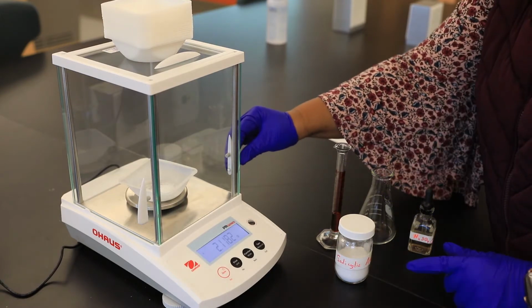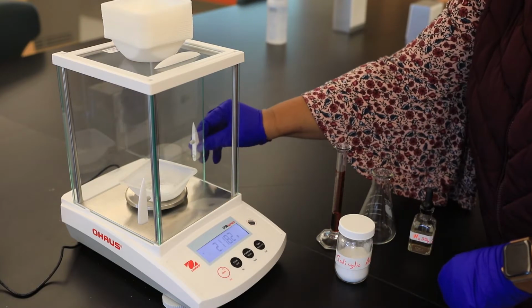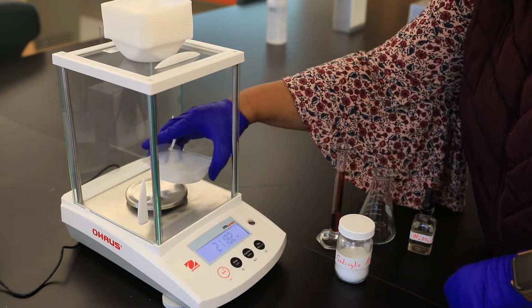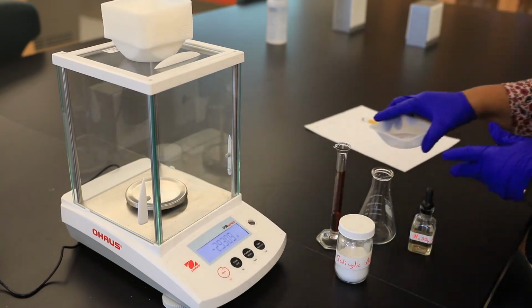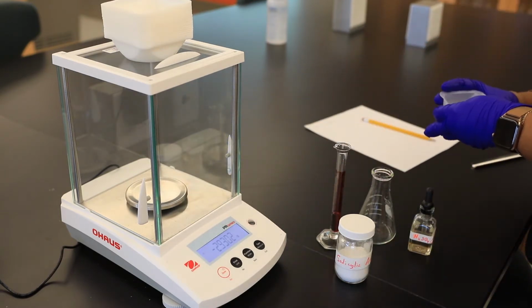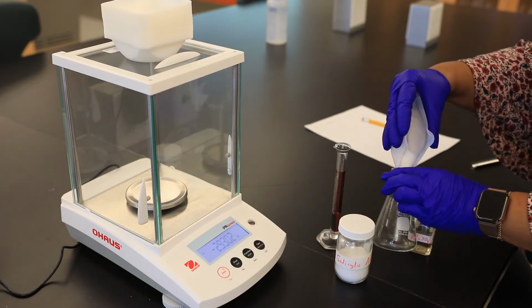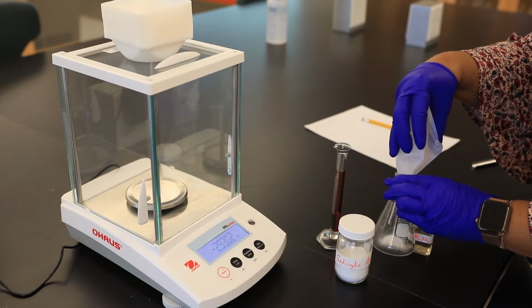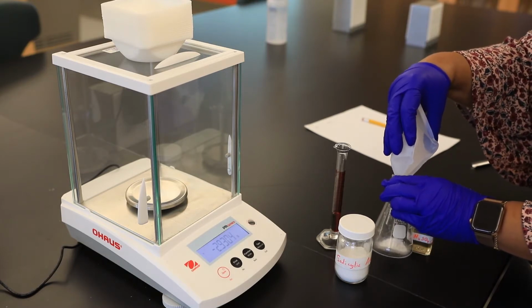And so what are we going to be using? I've already pre-weighed 2.1182 grams of salicylic acid. I'm going to go ahead and transfer it directly to my Erlenmeyer flask. This is our Erlenmeyer flask. I want to make sure that I'm adding the entire quantity of the salicylic acid.